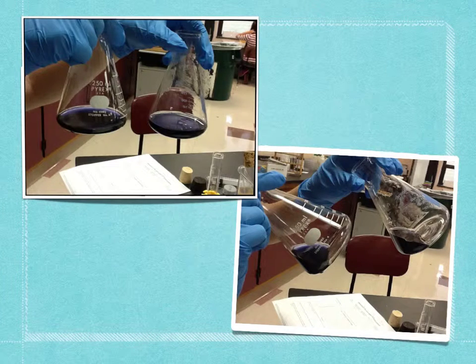Step 6. 10 milliliters of sodium thiosulfate solution was filled in a syringe and the initial volume was measured. Then we added the solution to the 2 samples of treated water until it faded to a pale straw color. Step 7. 6 drops of starch solution were added into each flask and mixed. The solution then turned dark blue.